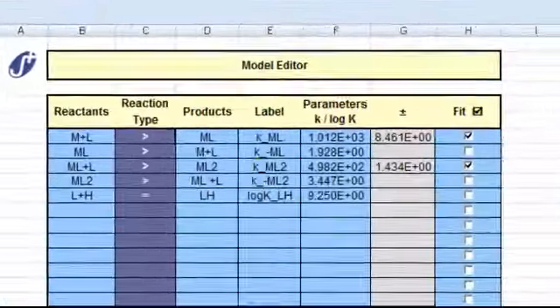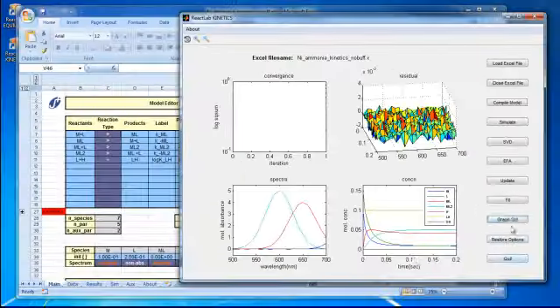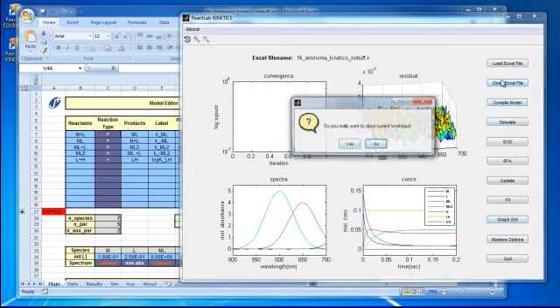The ability to incorporate protonation equilibria into kinetic models is a unique feature of ReactLab. It allows the correct modelling of pH changes, thus removing the necessity of using buffers, or if buffers are used, allows the computation of the resulting smaller pH changes.